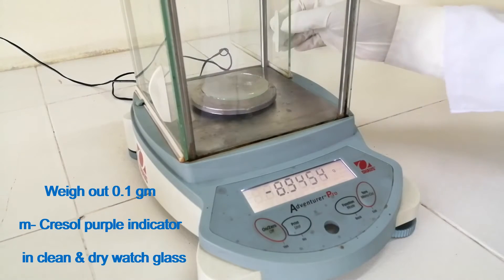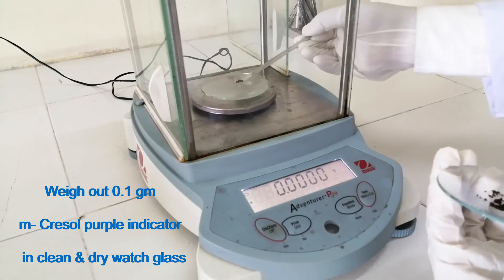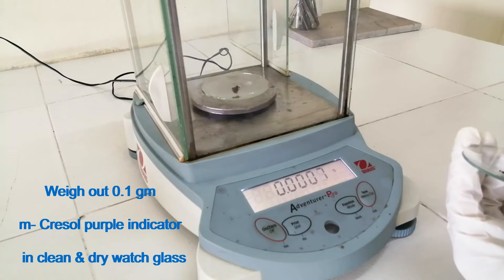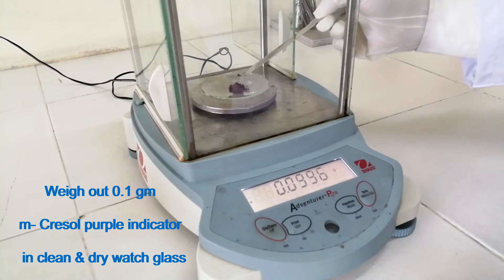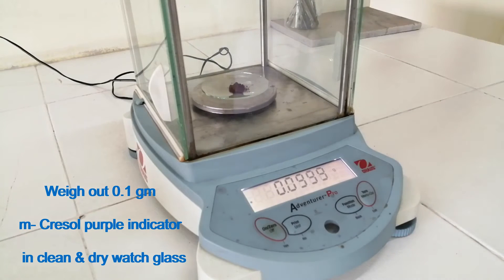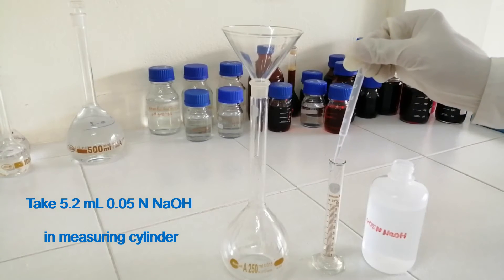Weigh out 0.1 gram metacresol purple indicator powder in a clean and dry watch glass. Take 5.2 ml of 0.05 N sodium hydroxide in a measuring cylinder.